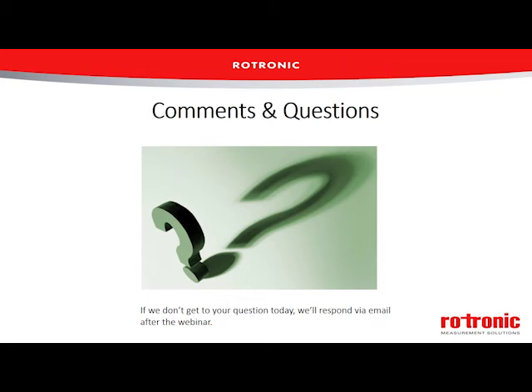The answer is yes, Rotronic does sell a very good calibration mixed flow generator and associated chilled mirrors and calibration services that are accredited. We don't sell a two-pressure system. However, in our lab, we do actually use all three of those technologies for humidity calibration. We've got saturated salts, a two-pressure system, and a divided flow system.